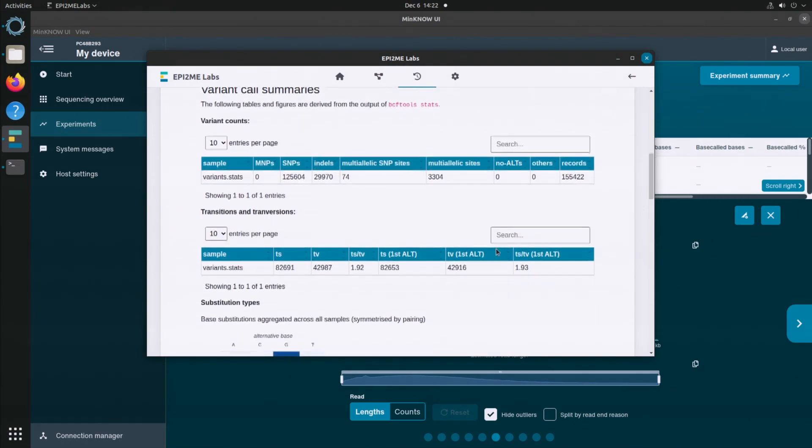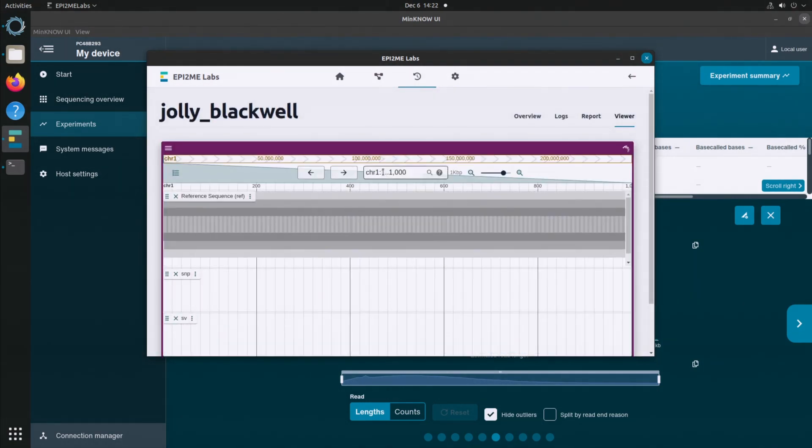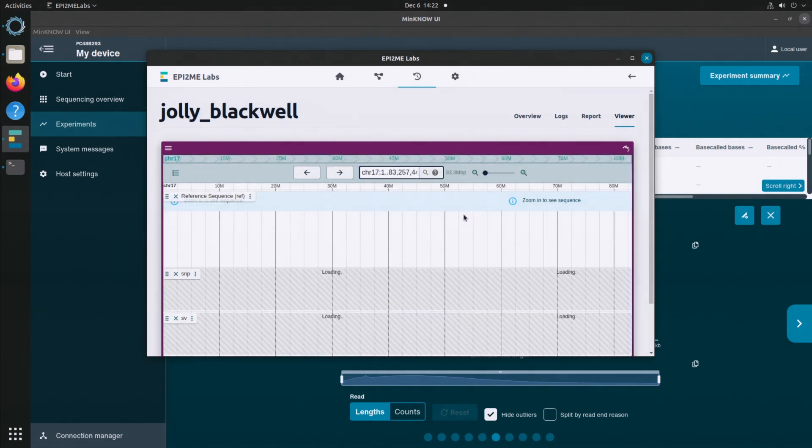We now have a track browser. We can explore our data. On our panel, we have the ability to open up the JBrowse 2 browser. Here we can see beautiful information — we've got SNPs, structural variation, and we can look at depth of coverage. This is reassuring: I've had a successful run. This genome is fit for purpose.